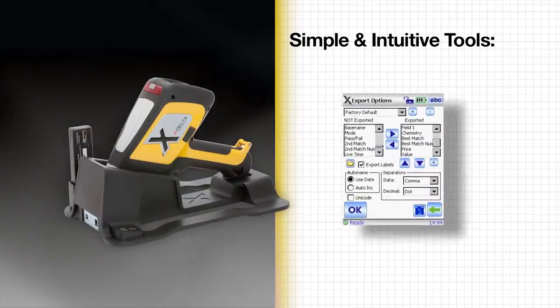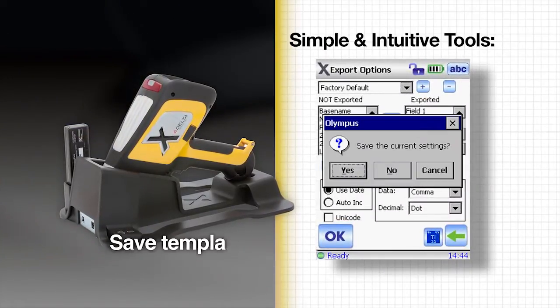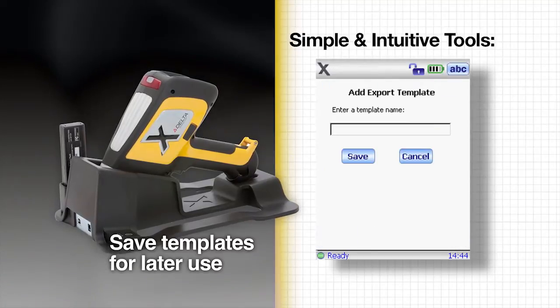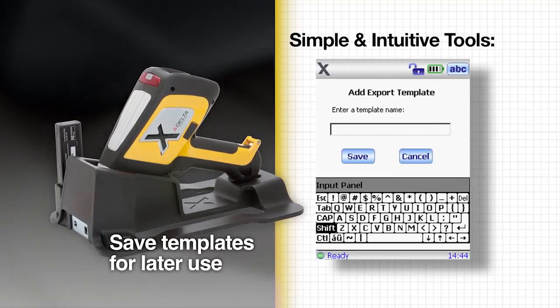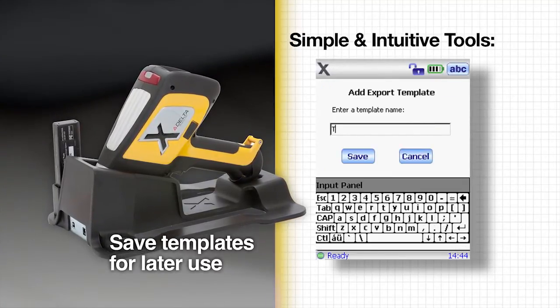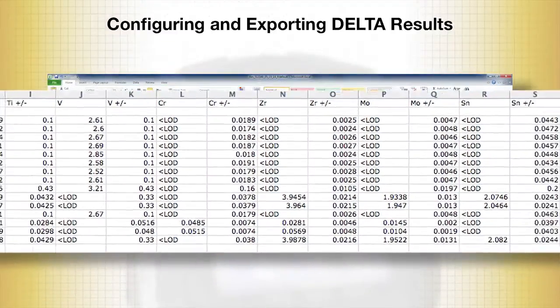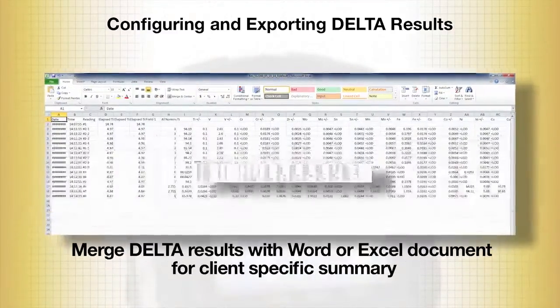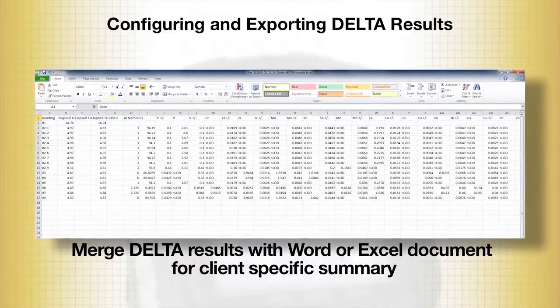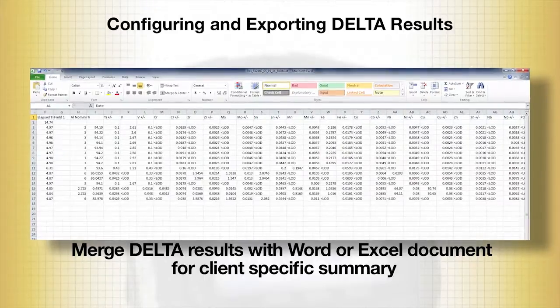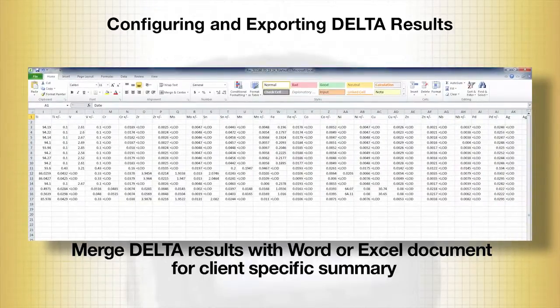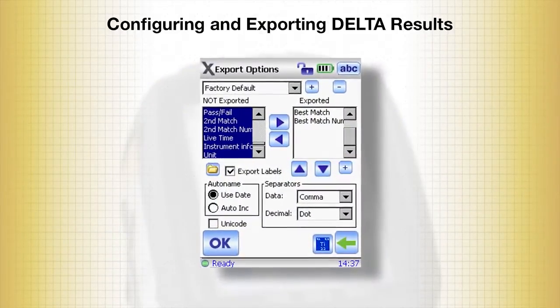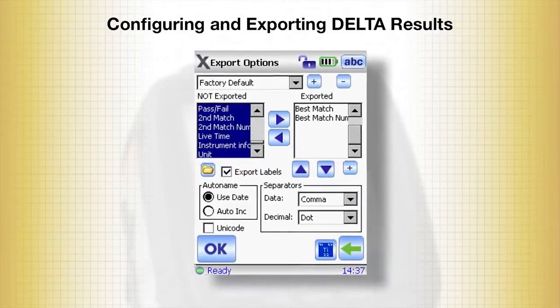If your organization requires more than one reporting format, you can easily save templates for later use. You can then seamlessly merge the Delta export results with a Word or Excel document to create a client-specific summary. The following example shows you how to create a custom report.